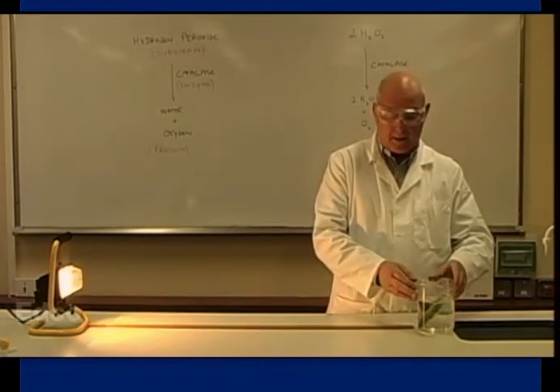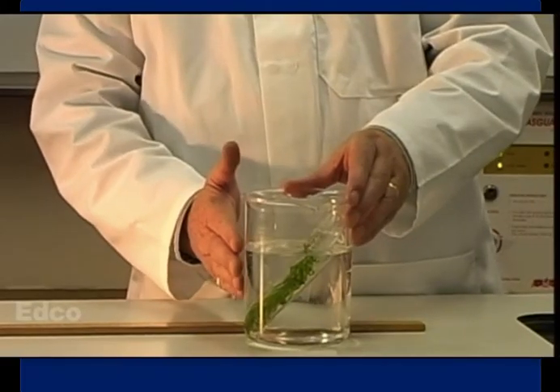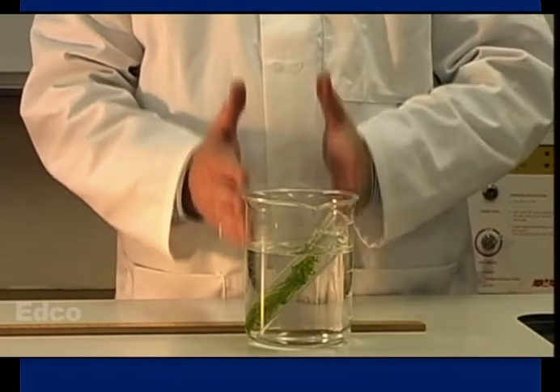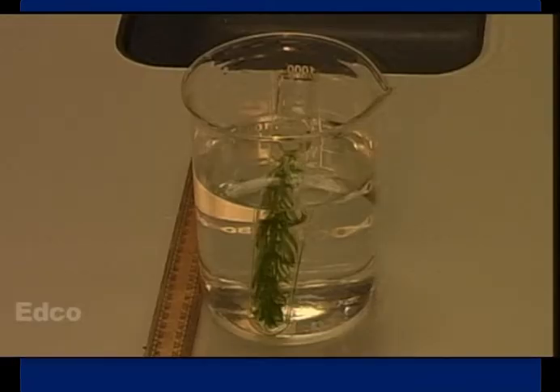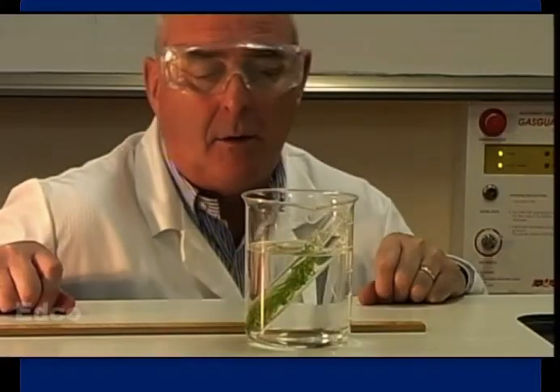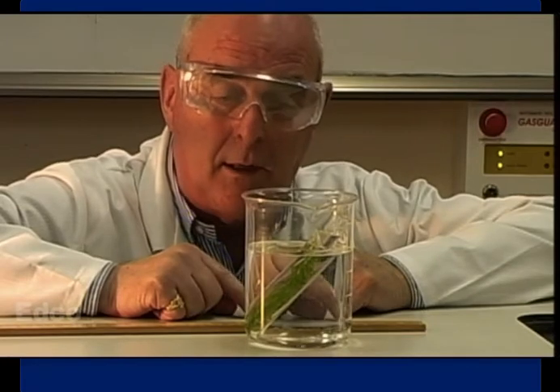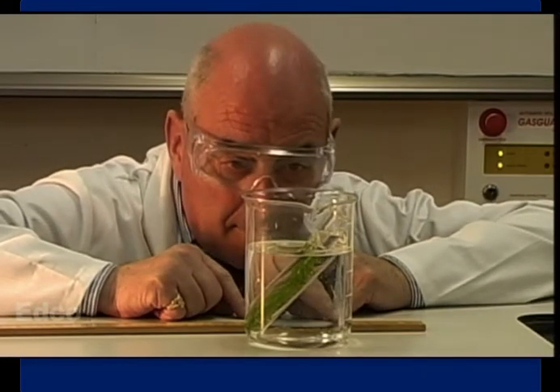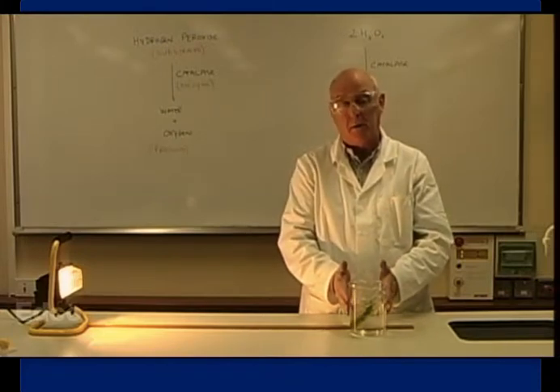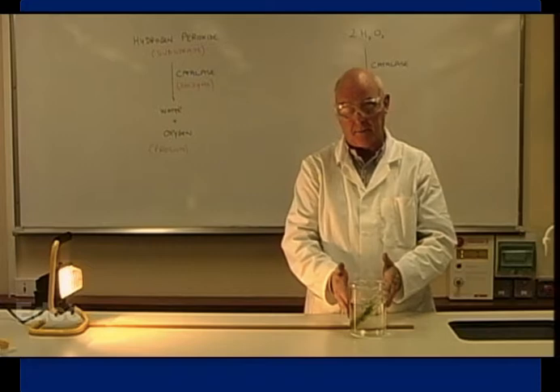We now move the apparatus in to the 80 centimetre mark, lining up the front of the water bath with the 80 centimetre mark. And we have to leave the apparatus there for 2 minutes to stabilise. Having left it for 2 minutes to stabilise, we count the number of bubbles per minute. And we do that 3 times and calculate the average. At 80 centimetres, the average number of bubbles per minute was 12. So 12 bubbles per minute at 80 centimetres.